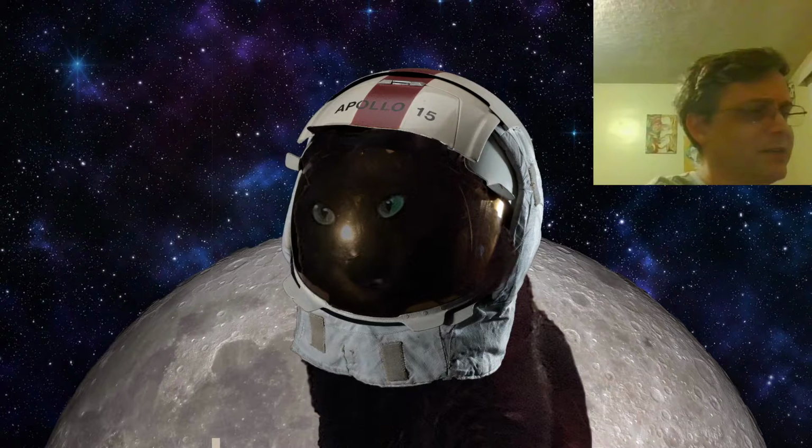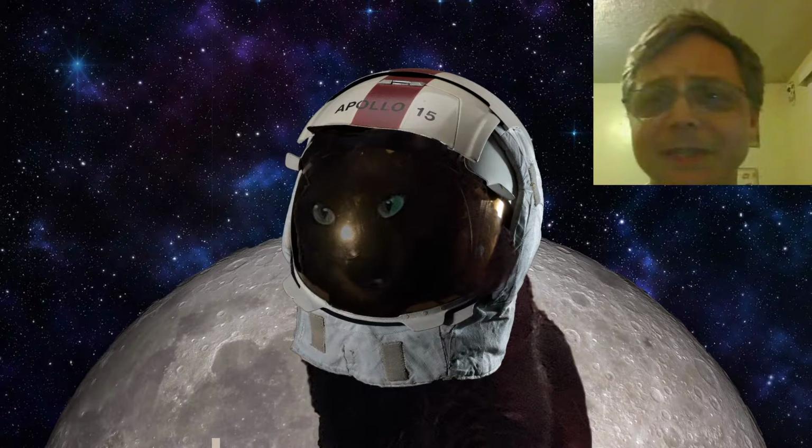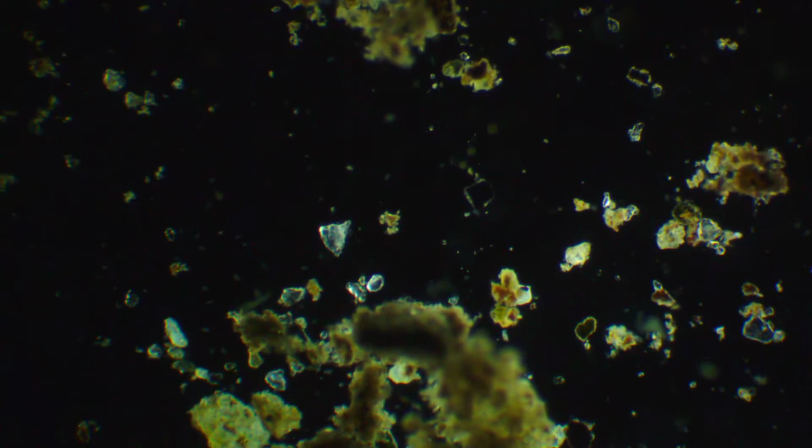Now I expect to find worms and dead things in this one. There we go. What do we got? Looks very similar to before, but look, there's a worm. There is a worm. Now, like I said, I'm looking for worms and dead things because I expect there to be some. Wow, there's a worm.